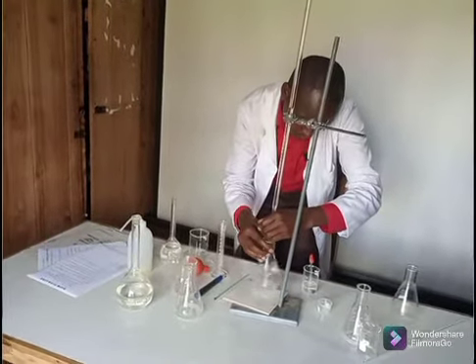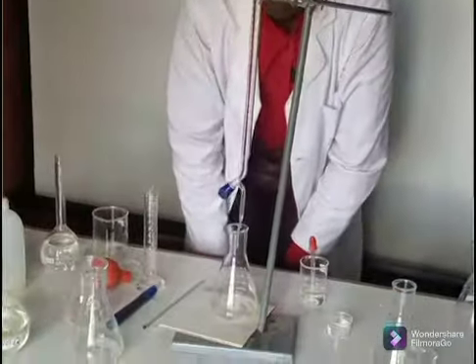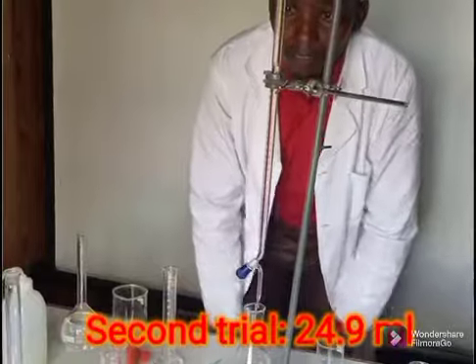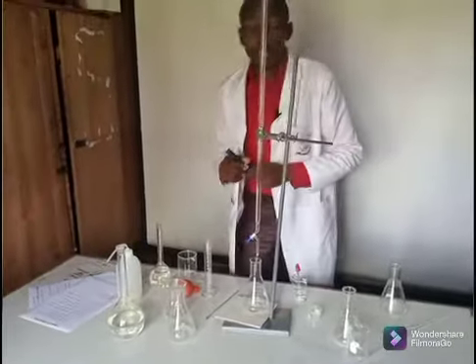Okay, now the pink color has just disappeared, and I can do my reading once again. Oh, good. This one reads 24.9. So I'm within the range.